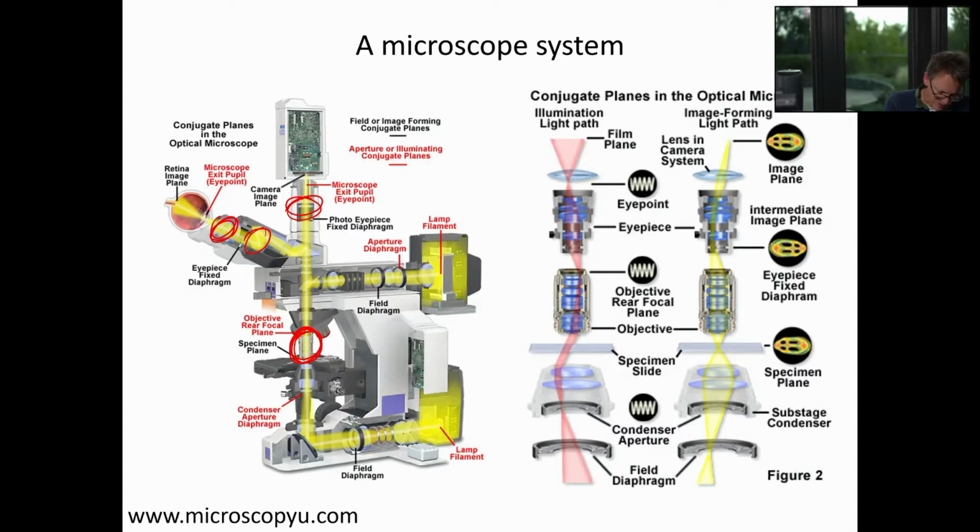You can excite. So let me just get rid of these again. I can illuminate the light from below to do a bright field microscopy experiment. So the light goes in from down here, bounces up, goes through the condenser onto the sample, is refracted and diffracted, and is then captured by the objective lens, passes through this, and then goes up here, goes through the tube lens, and forms an image on the CCD chip here.